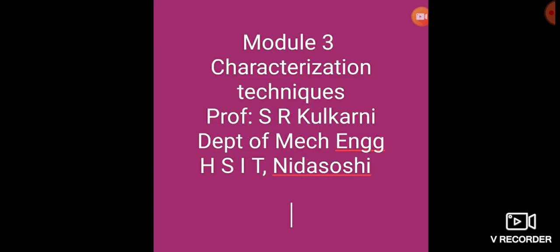Topic in Module 3 is Characterization Techniques. Characterization is the process of identifying various particles by particle shape, size, surface properties, charge properties, mechanical properties, and microstructure. There is a broad range of commercially available practical characterization techniques that can be used to measure the particulate sample: the particulate or particle size and shape distribution.